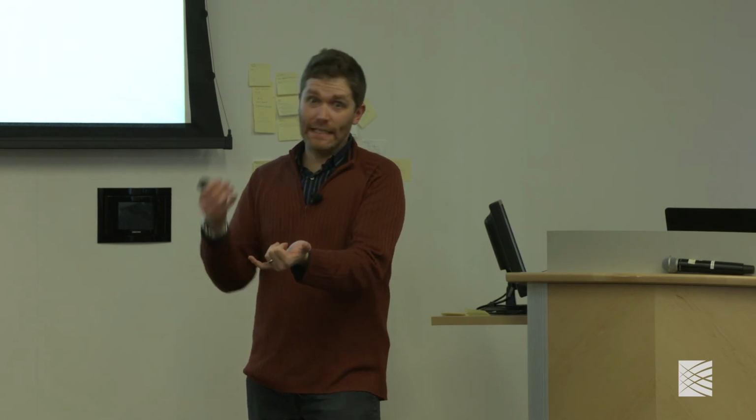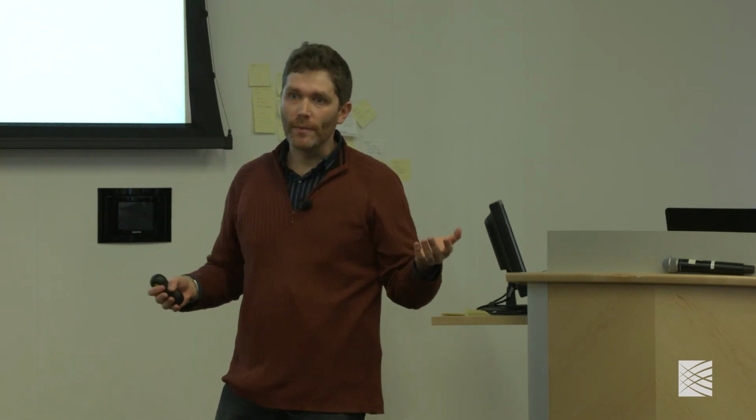If that's the case, then yeah, WGS, of course. The reason I'm waffling is, if you run it on WGS per sample, it's going to be more expensive. But you're going to get better resolution of where the breakpoints are, right? Because with whole exome, it can only find breakpoints at the targets, whereas you've carved up the entire genome. So I would say it depends on what you're trying to do.